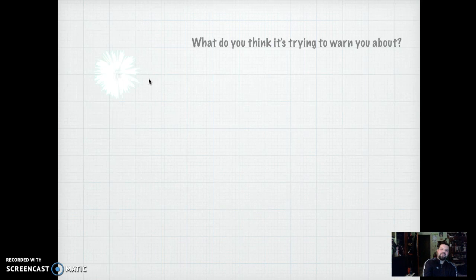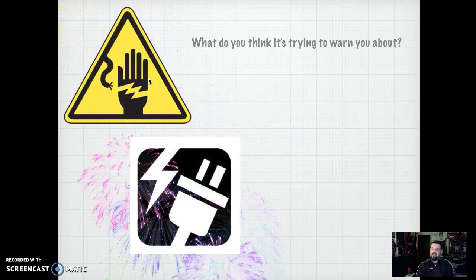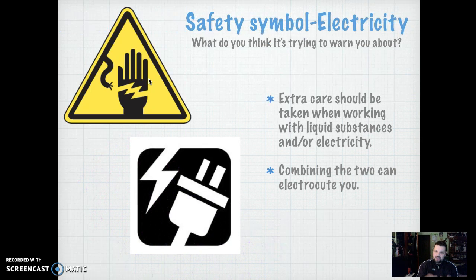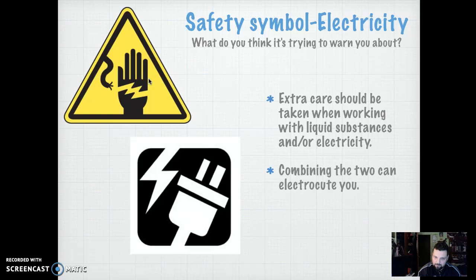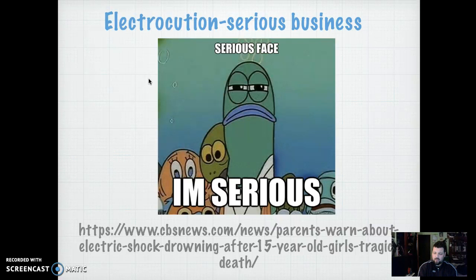How about this symbol right here? That would be the electrical safety or electricity symbol. Extra care should be taken if you are working at a table where there is electricity, because your substances or liquids — especially water — can mix and combine and electrocute you. You must be aware that you have electrical outlets at your lab tables, right next to the actual faucets. There's a link to a news article about what electrocution is like in real life — people actually lose their lives when electrical wires are torn and touch liquid water, causing an instant current.